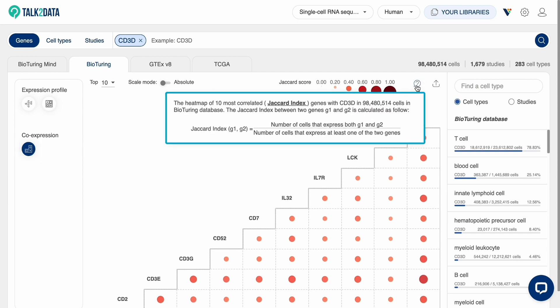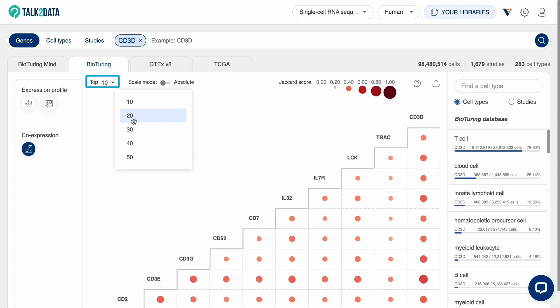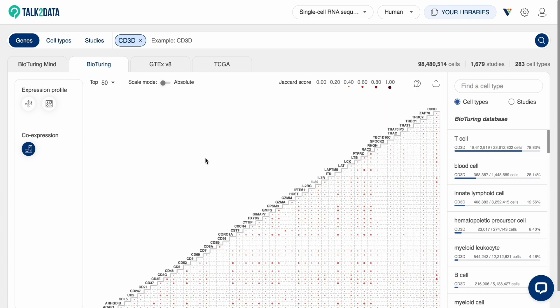A matrix displays the co-expression calculated by the Jaccard score. You can view up to 50 genes.